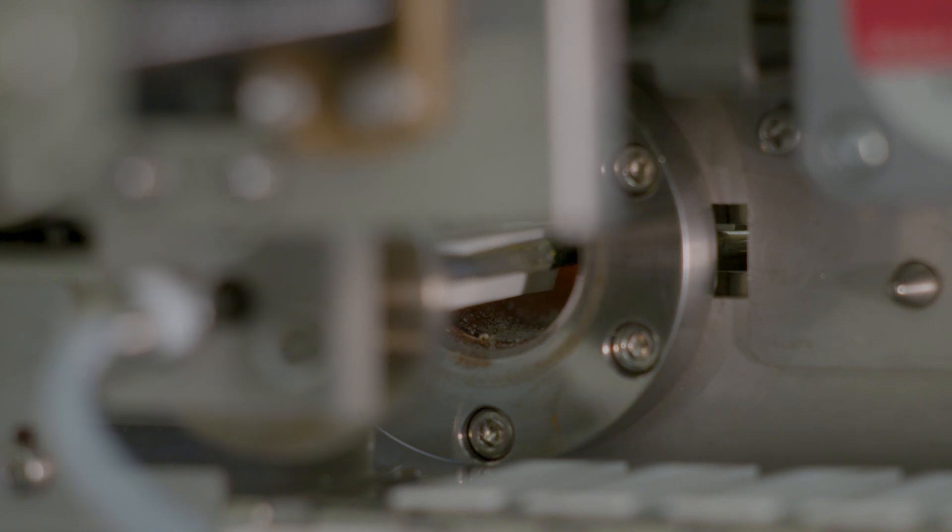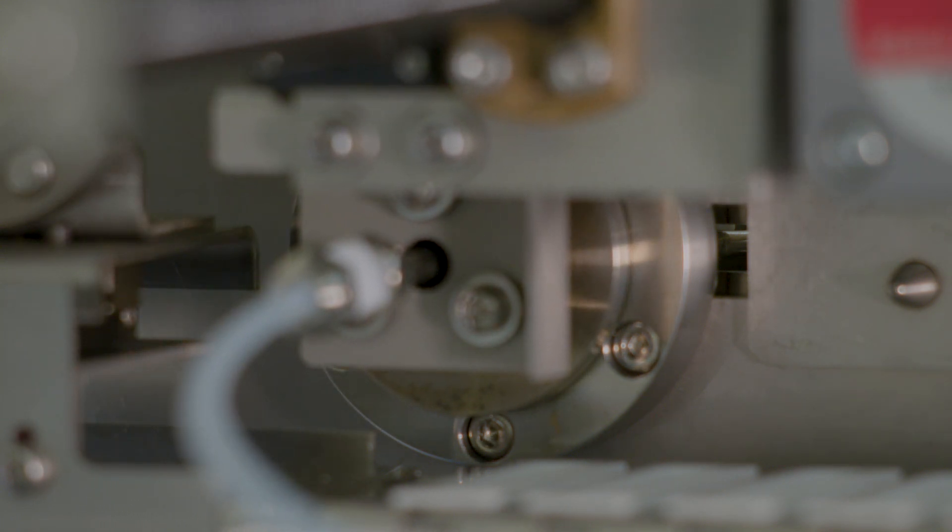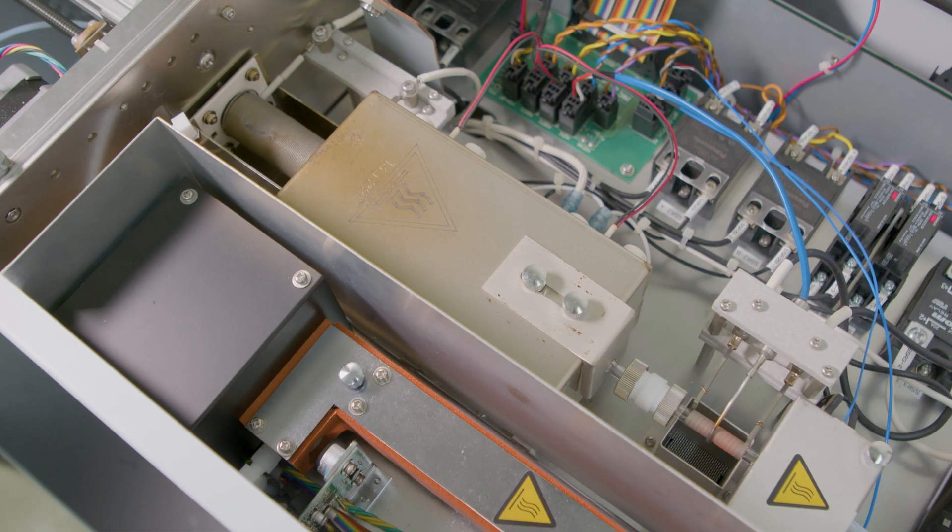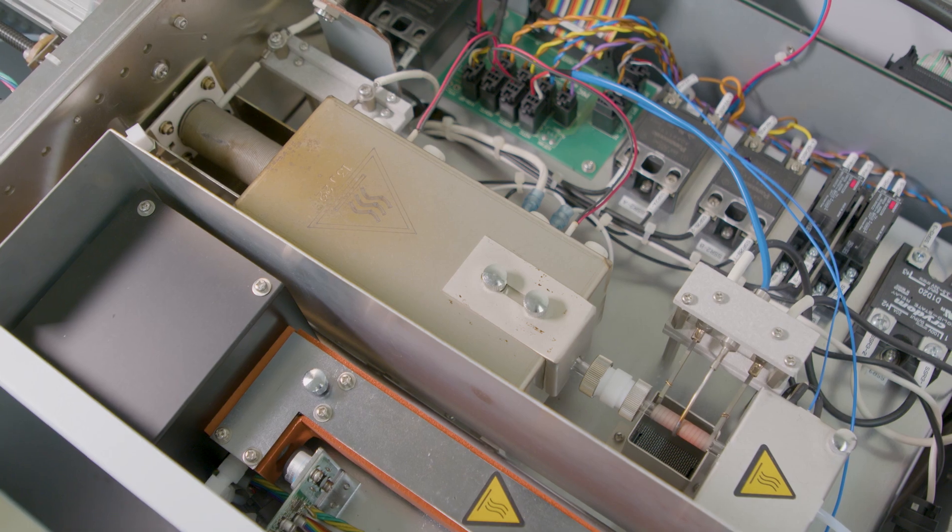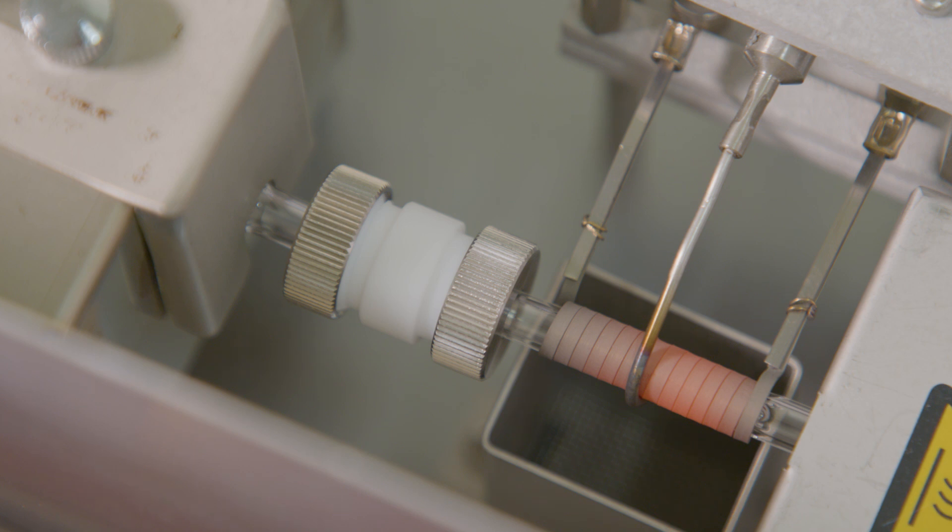The TDAAS process involves heating the samples above 800 degrees Celsius to decompose methylmercury, or oxidized mercury, into a gaseous form. Elemental mercury is then temporarily collected as gold amalgam and condensed in a mercury collection tube. The collection tube is then heated to release the mercury, which is atomized and transferred into an absorption cell for measurement.